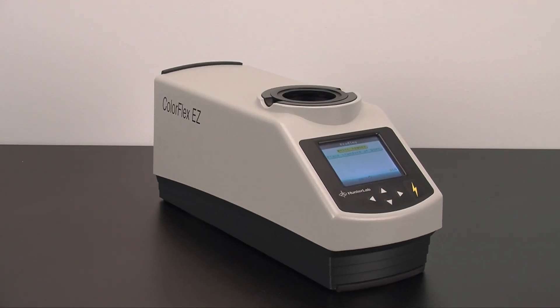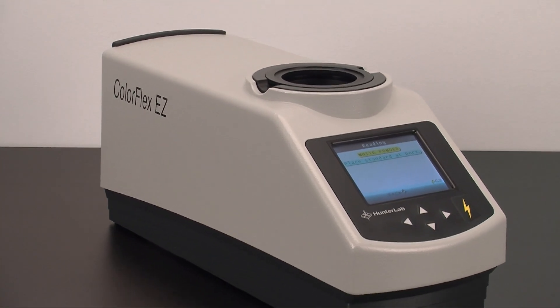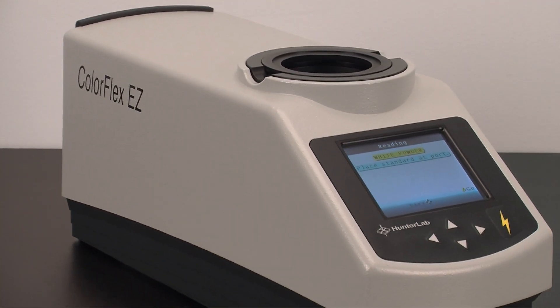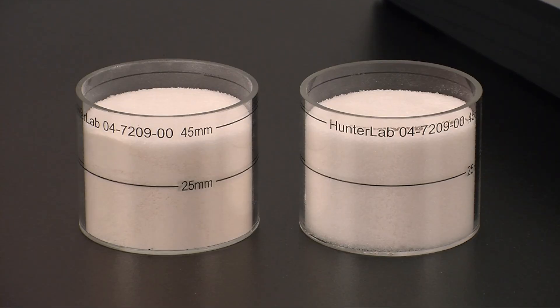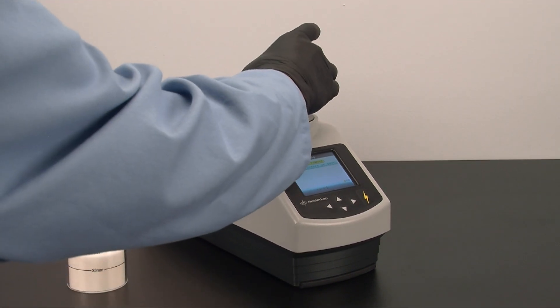A key feature in the ColorFlex EZ is its ability to numerically see and measure the difference in color between two visually very similar samples. For this demonstration, let's test two powders. Here's the first sample, which we'll also call our product standard.